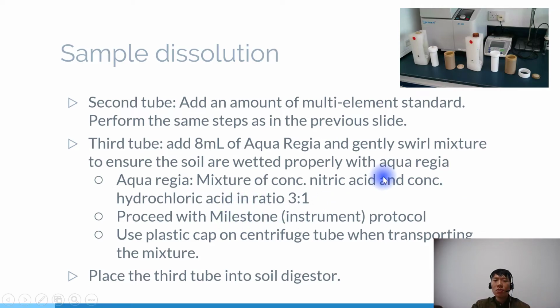Then you proceed with this milestone. You see, you wet it, right? Put inside, right here. Open the cap, put inside there. This is where the sample is being scanned. There's a protocol. Okay, check out another video, but it's not tested in this module. It's for the lab, but I want to give you a bit of coverage.